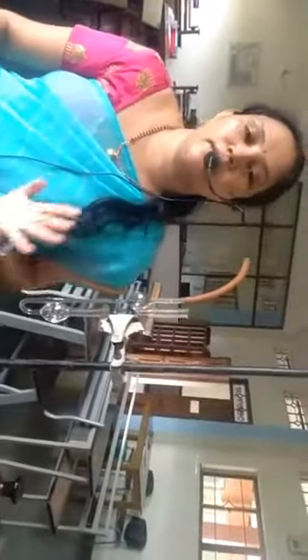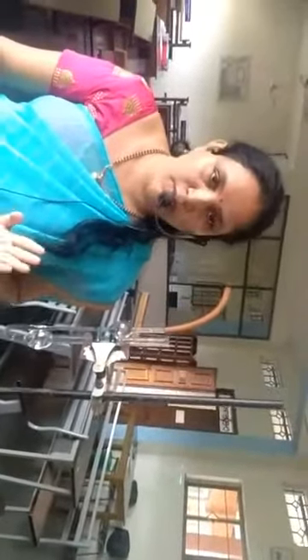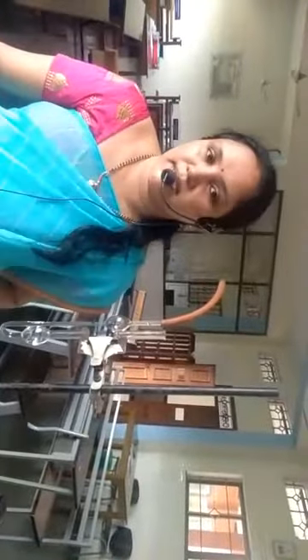Whatever temperature you are recording the readings at, you have to take the readings for water at the same temperature, because comparison can be done only at the same temperature. Along with that, the temperature affects the viscosity. As you all have seen, there are certain liquids.